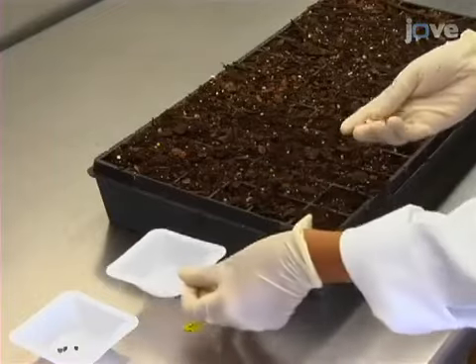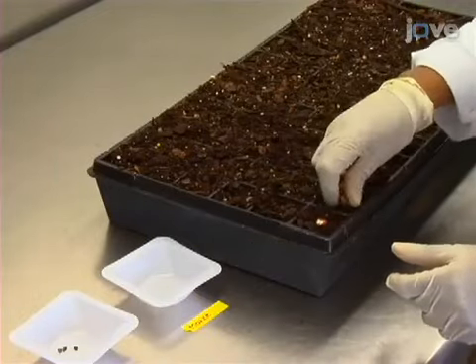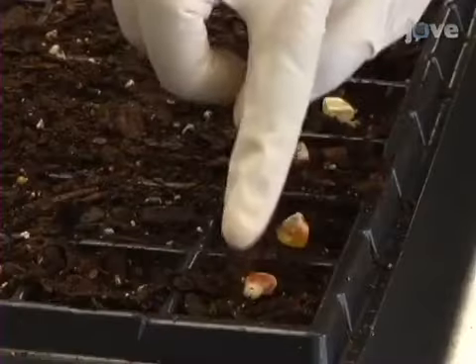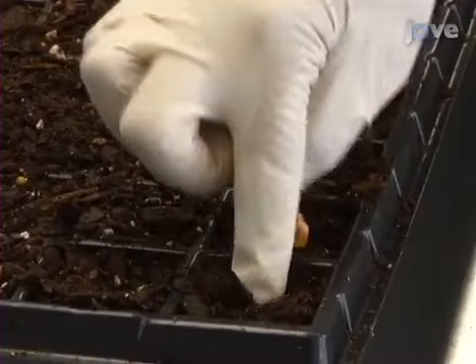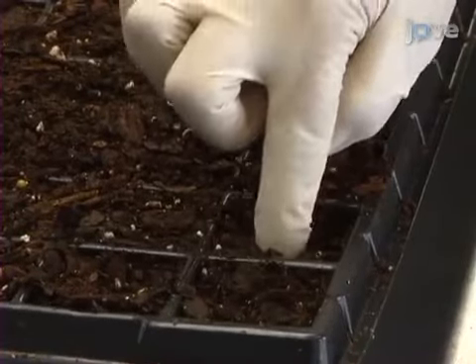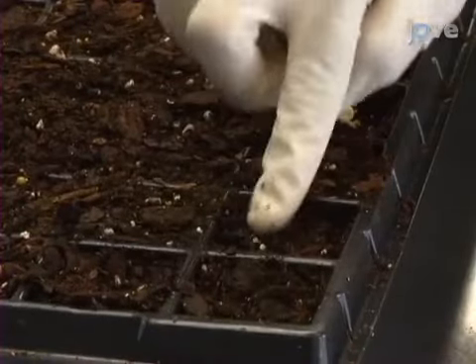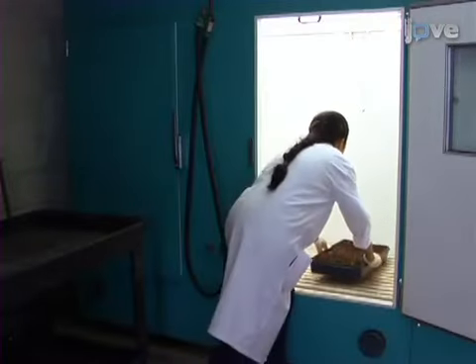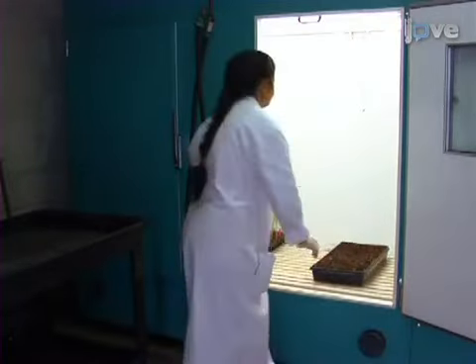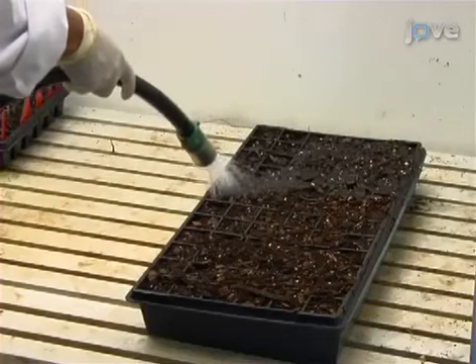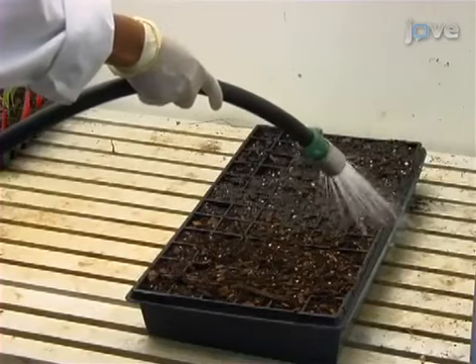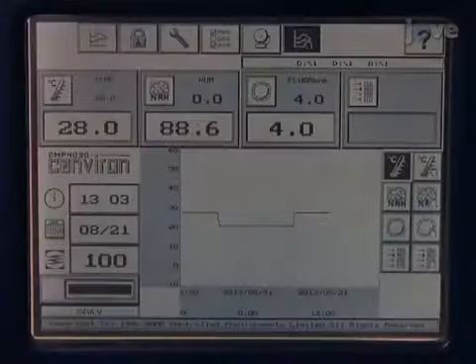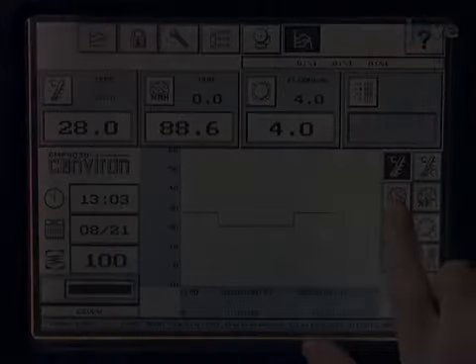For experimental and control needle injection inoculation experiments, plant four seeds of each plant line in small flats by pushing the seeds about half an inch into the soil with the finger and lightly covering them with soil. Then place the plants in a growth chamber and water the seeds until soaked, ensuring that they remain under the soil after watering.